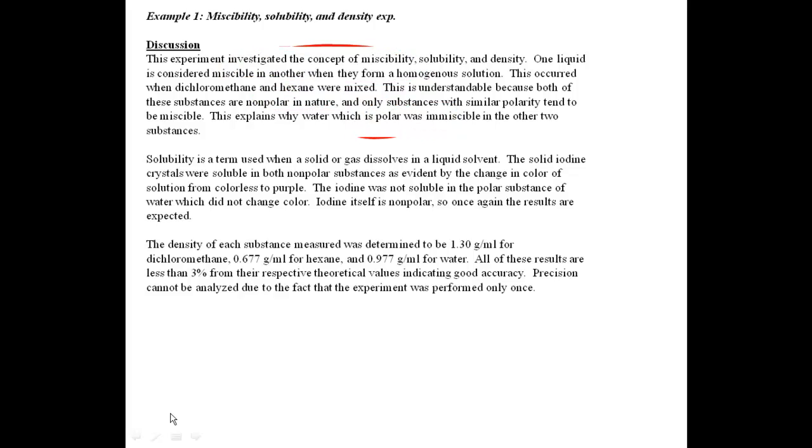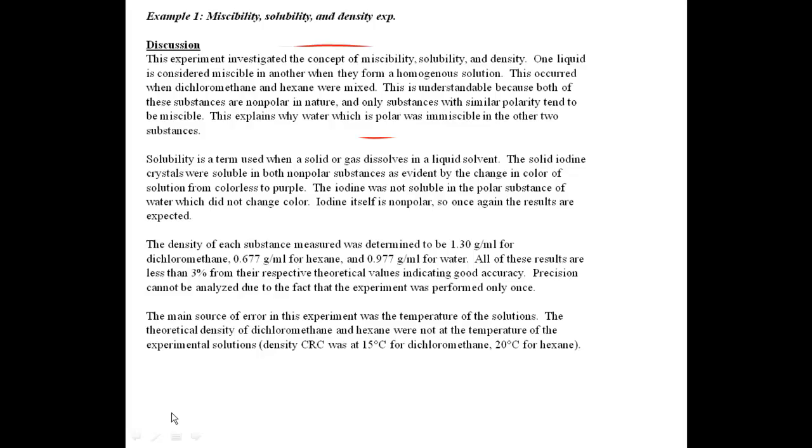Last thing that I expect in a lab report is to talk about error. Error is not just saying human error, or we could have made mistakes along the way. You have to think about the experiment. I want you to think about what mistakes could have happened, what could be causing problems. Not that I'm saying that happened or didn't happen. What can affect the experiment? I want you to think about it.